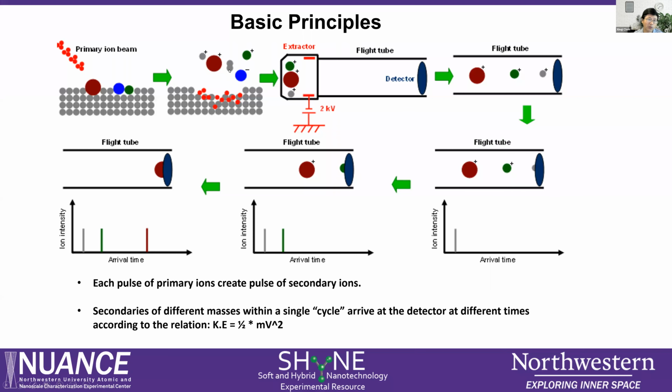Mostly it is neutral. Then we apply an electric field, applying the potential on the sample, and get to an analyzer. You see here the electric field, so only the ions can get to the analyzer. Positive ion or negative ion is a different mode. If it is neutral, it just flies away and cannot get detected.